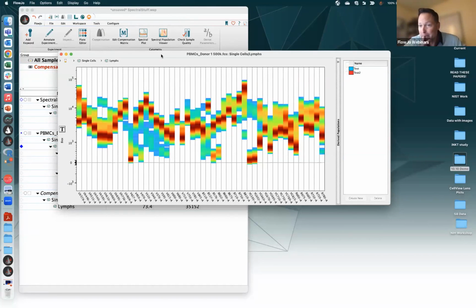Those are the last of the help documents I'm writing. I have the first help doc on this one going. No, sorry, these are done. It is the B cell view lens. I still owe one more doc, and I still have to edit one more. So apologies if you hit the cell view lens docs and it says in progress. That's on me. Okay, so that is the spectral plots.